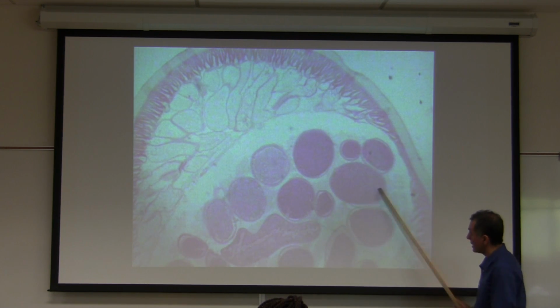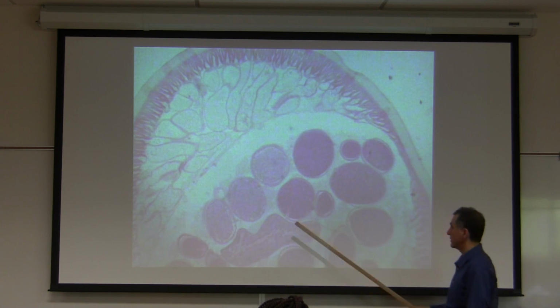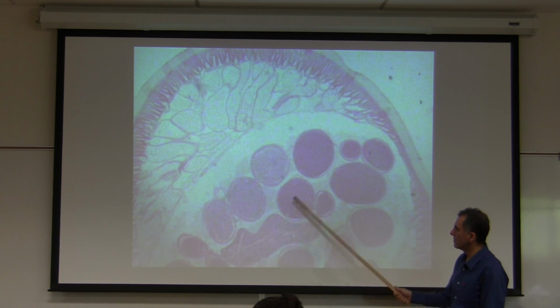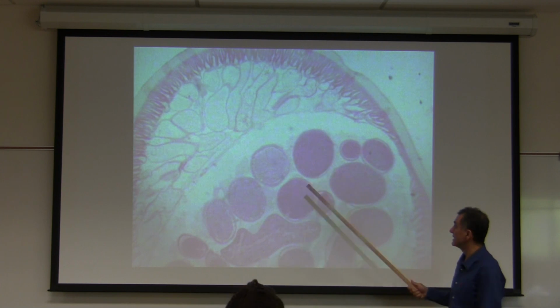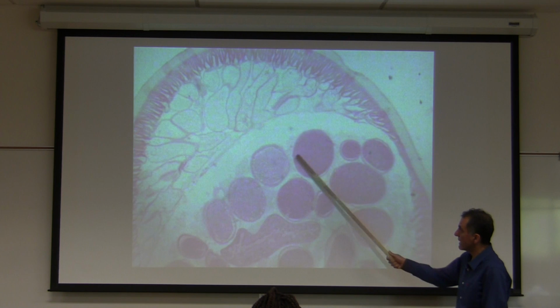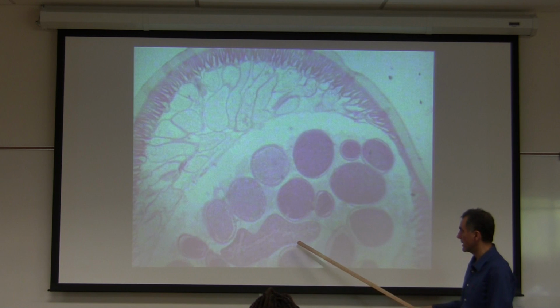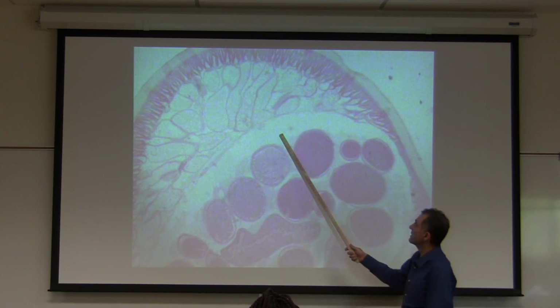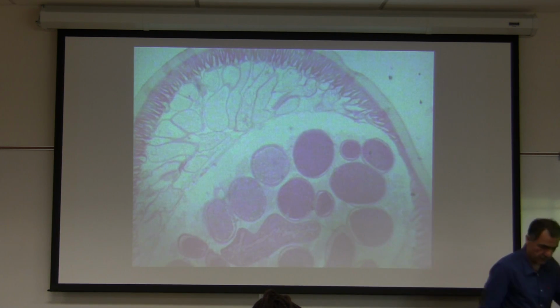And a little bit bigger one are seminal vesicles, ejaculatory duct, whatever you write down is accepted. What is it? Vas deferens. Okay. All of them. Except the testes, you don't have to tell the vas deferens, ejaculatory duct, and seminal vesicles apart. What is the name of structure? Intestine. What is the name of the area or structure? Pseudocoelom. Okay.